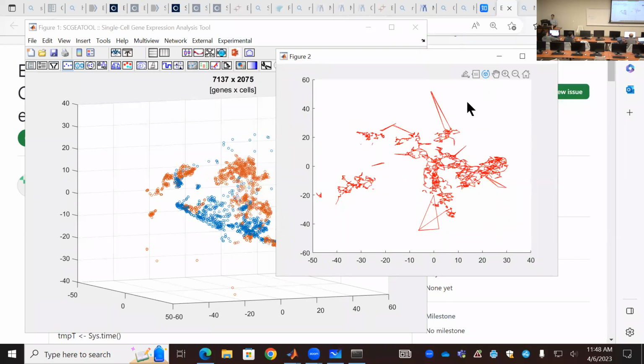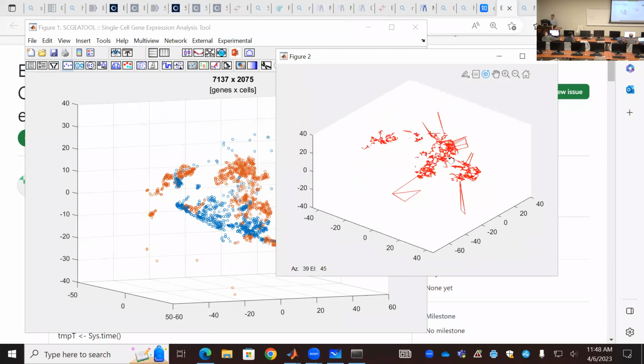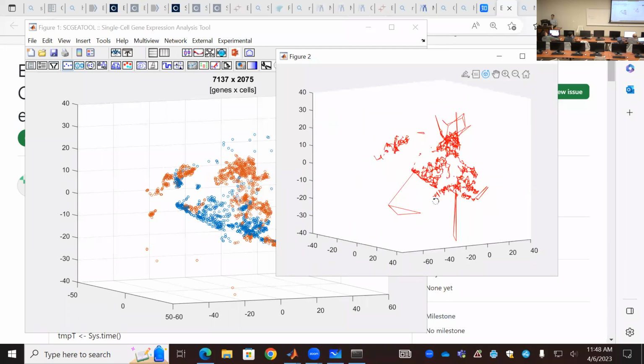Is this 3D or 2D? Yeah, this is supposed to be 3D, okay? So look at the cells in this region, this part here. They form a triangle because you use K equals 3, so they try to find each other, the nearest neighbor.